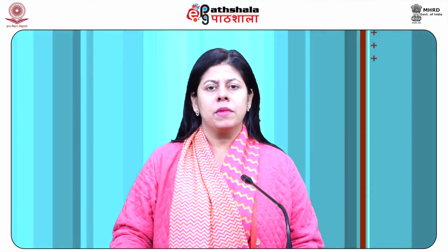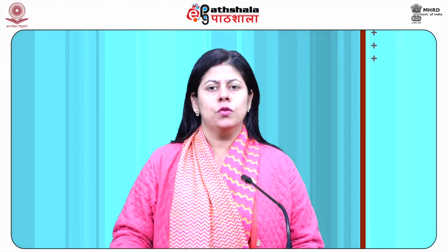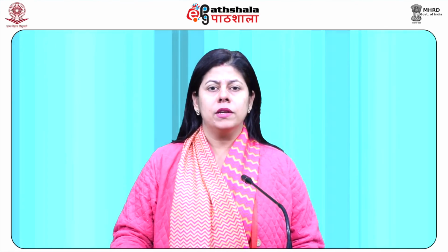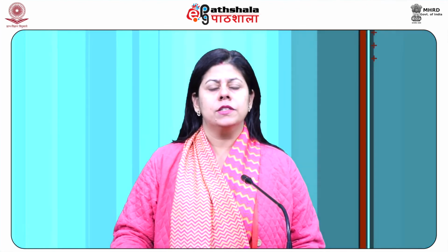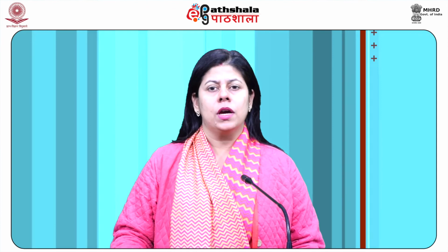Stereo or dissecting microscope is an optical microscope type fashioned for low magnification examination of a sample using incident light illumination rather than transillumination.